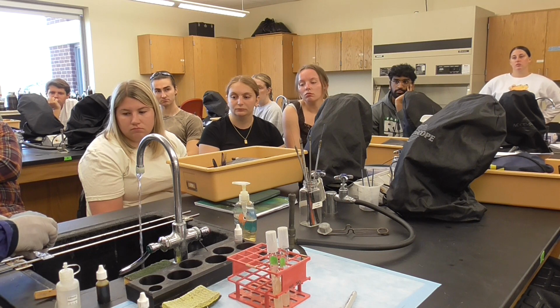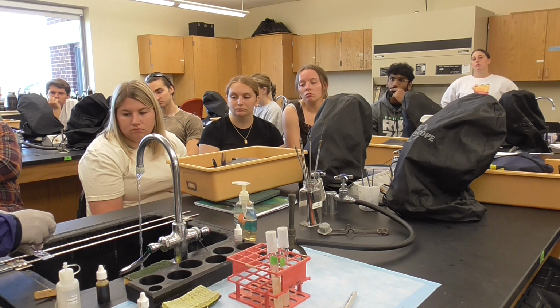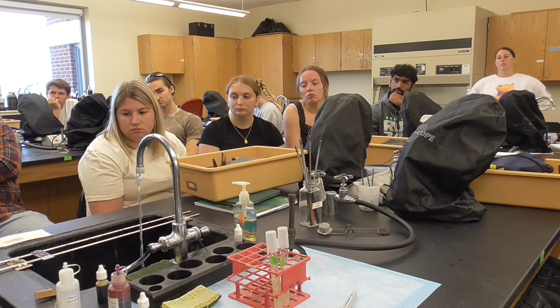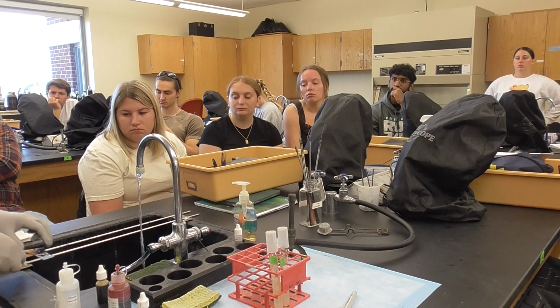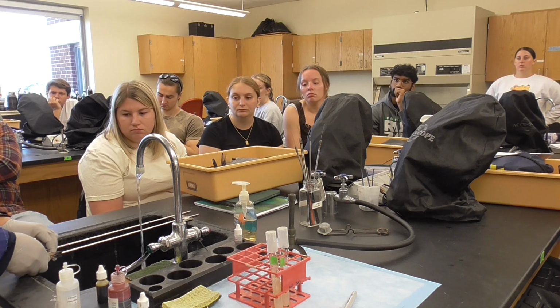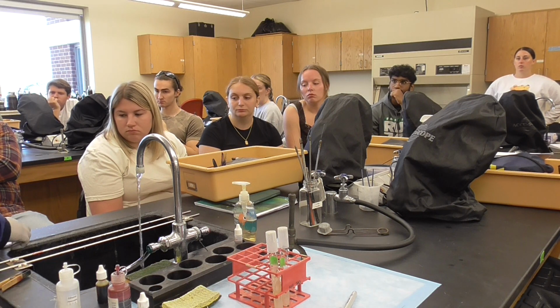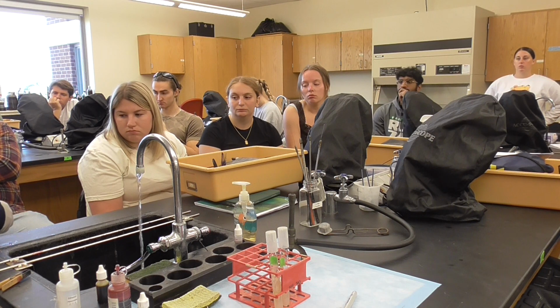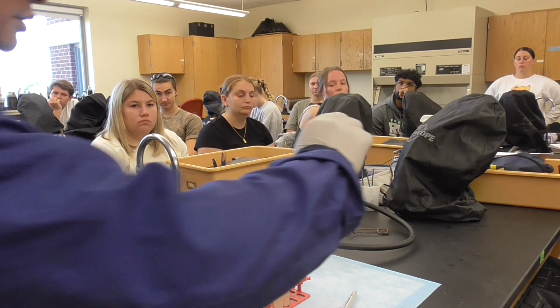That will be staining 60 seconds. Not sure this one is good because this is already being in the sink. So 60 seconds, let's say over 60 seconds is ready. So we rinse it. And then you make sure it's dried. And it's ready to go. We'll see whether this one is good or not. We'll see in a second.